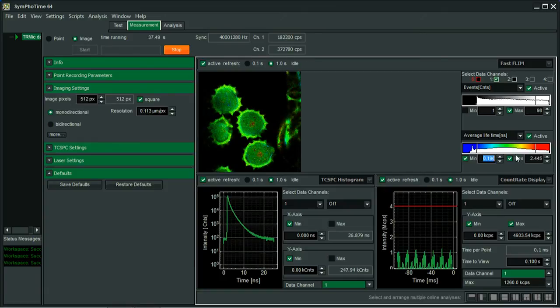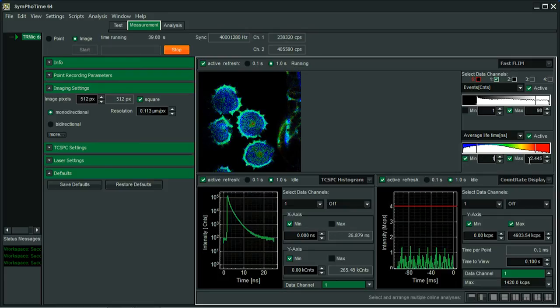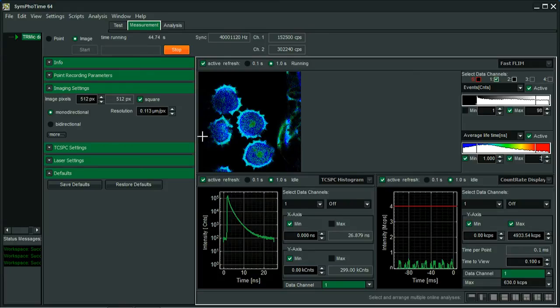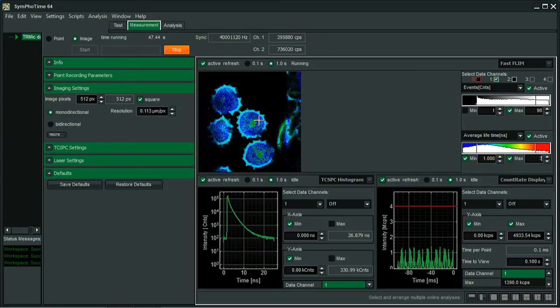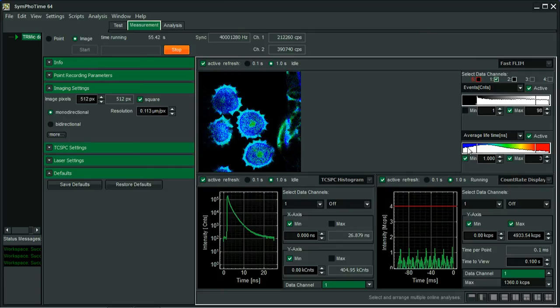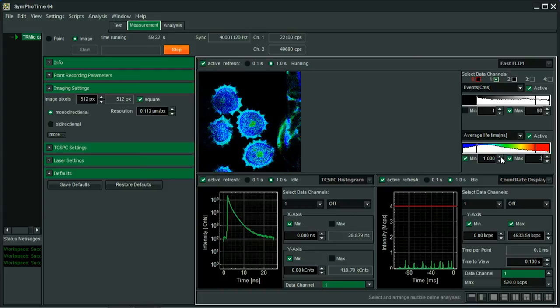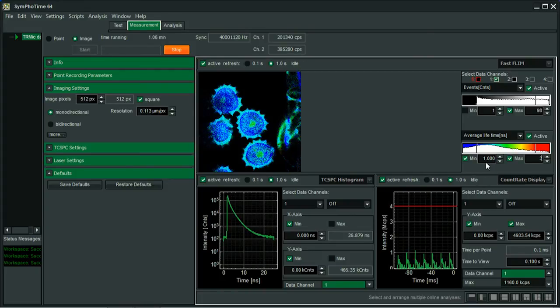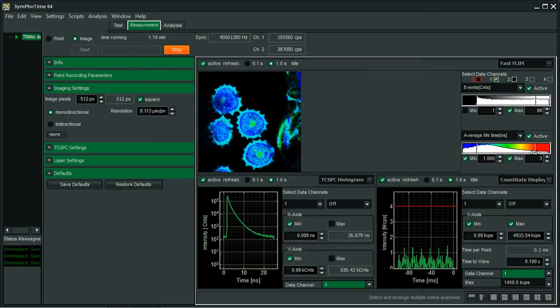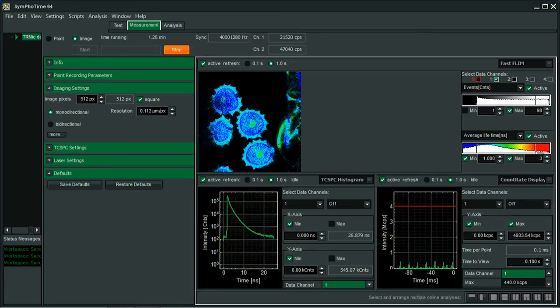For example, I will tune this between one nanosecond and three nanoseconds, and we'll see that we've got regions which are blue, another one which are more greenish. The lifetime is displayed in a rainbow scale, so blue means short lifetime, red means long lifetime. At the moment, every pixel with lifetime below one nanosecond is displayed as blue. Every pixel with lifetime above three nanoseconds is displayed as red, and everything in between is in this rainbow scale.